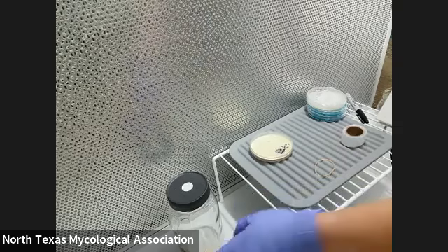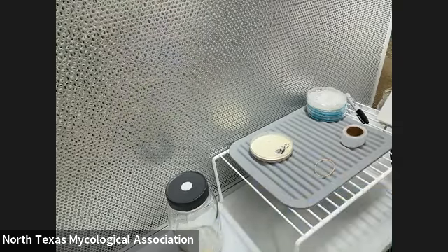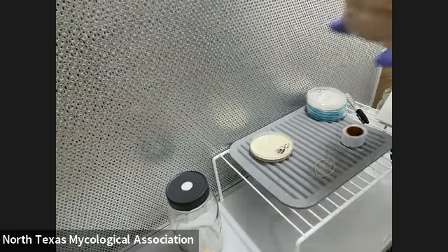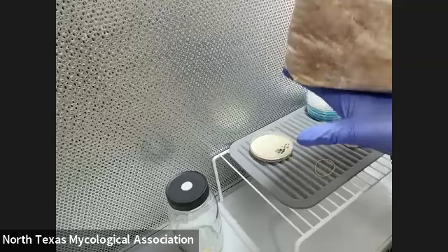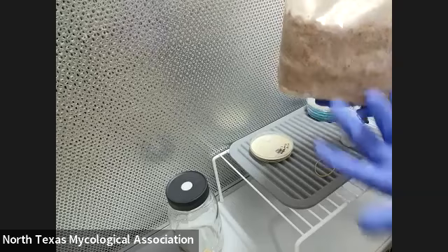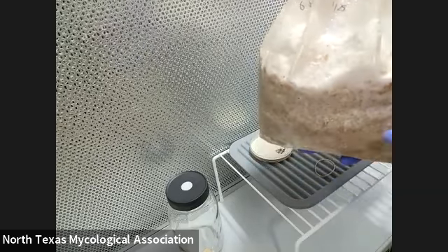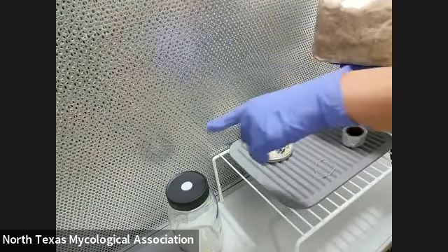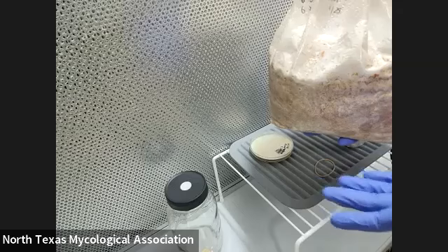I forgot one more thing. After the grain is fully colonized, we're going to add it to a bag. This is called a substrate — it's a mycelium block. This is what they use at farms to grow mushrooms; the inside is sawdust. So we go from agar to grain and then to the sawdust substrate. That's how you get mushrooms.